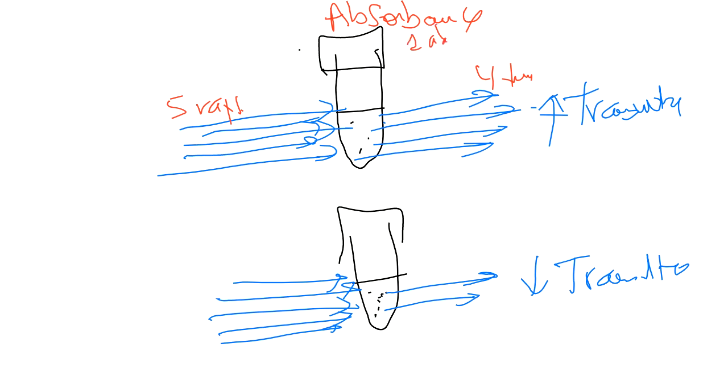The lighter the sample, the less the absorbance. The cloudier the sample, the higher the absorbance. I'll show you why we measure absorbance and not transmittance. But you could do either one. It doesn't matter. You're doing the same thing.